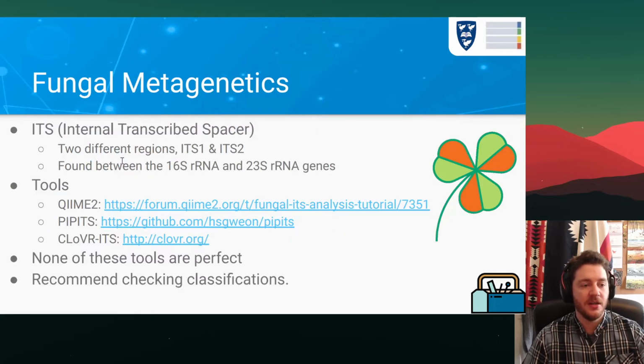But first, a brief mention about fungal metagenetics. So we talked about 18S sequences briefly, where you can use the 18S sequence instead of the 16S if you're looking at eukaryotes.